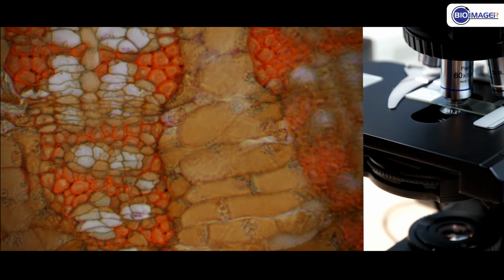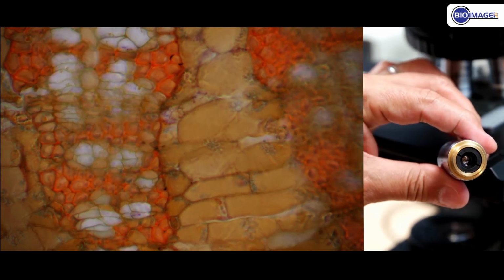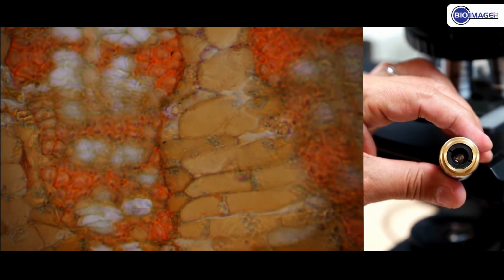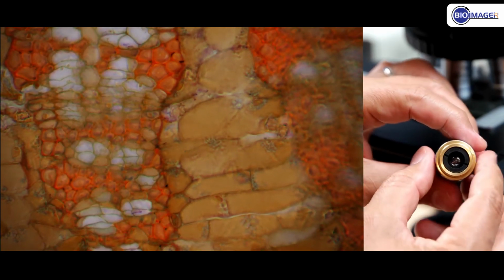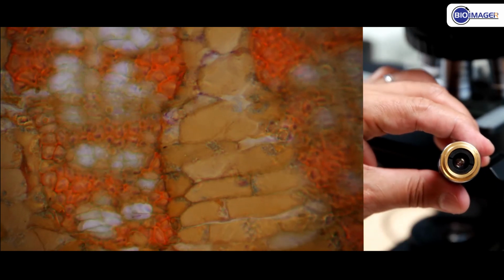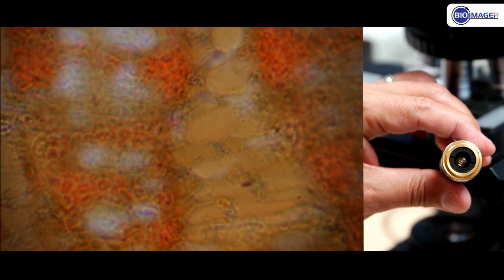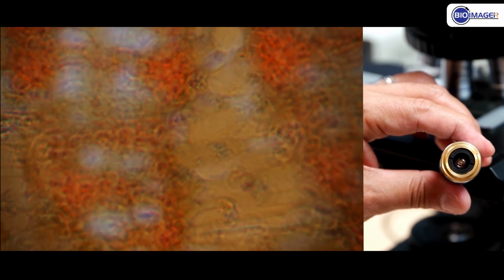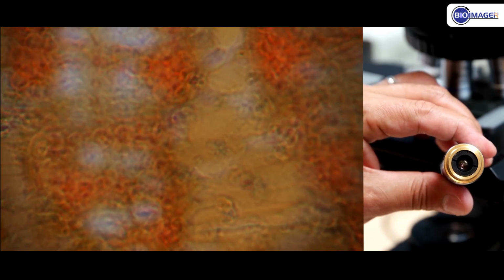And one more thing is, if you look at this phase contrast lens from the back, you'll see a phase ring inside this objective lens. Please do not use phase contrast lenses for epifluorescence imaging. The UV light will damage the phase ring inside the lens and it will melt.